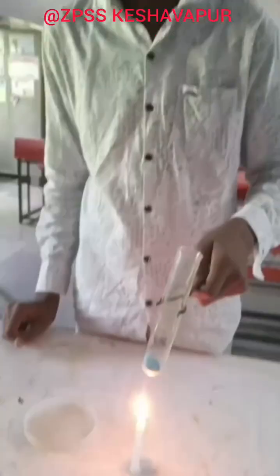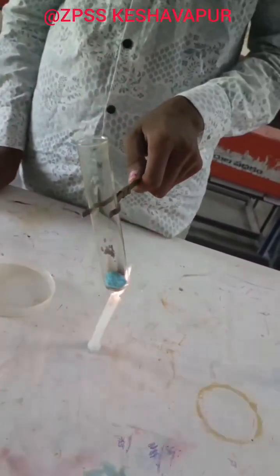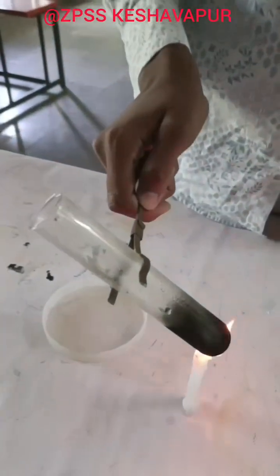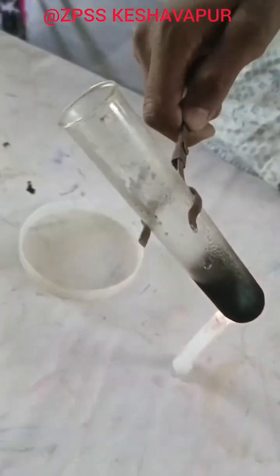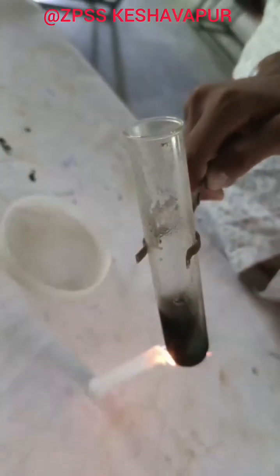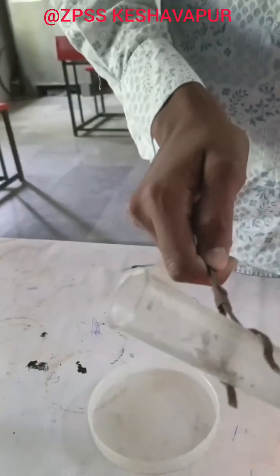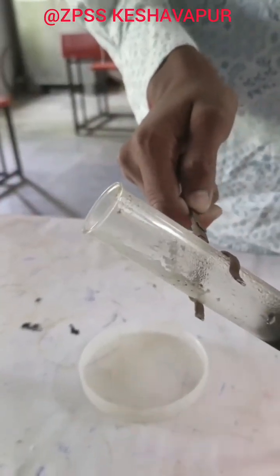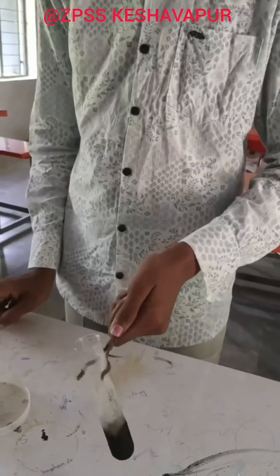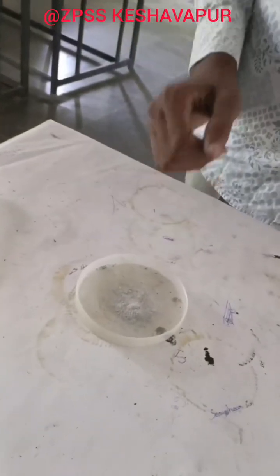Now I am applying heat. Look here — water present in the crystals is evaporating. Vapours are coming out. Now you can see the color of the crystals has turned white.